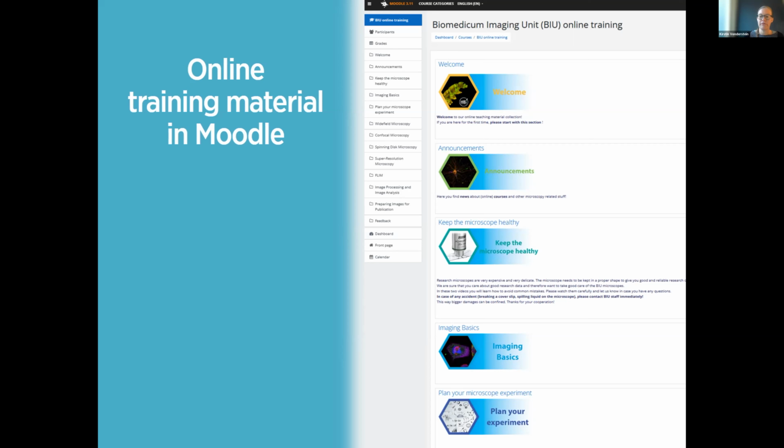So in this Moodle, they find the videos for the online training, but they also find, for example, material which I find very important during the pandemic: how to keep the microscope in good shape if they are there on their own. For example, there we have used and adapted videos from Jennifer Waters from the Nikon Imaging Center, which I found really helpful and I was very happy that we're allowed to use.